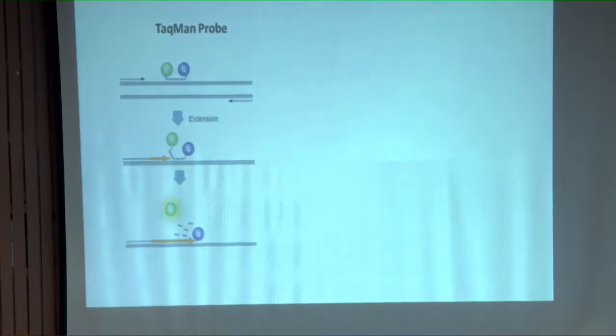So this probe is decorated by two chemicals. One is called a fluorophore, indicated as R, and another chemical is a quencher. In a few slides you will come to know why this setup is needed in this particular technique. You have a probe.